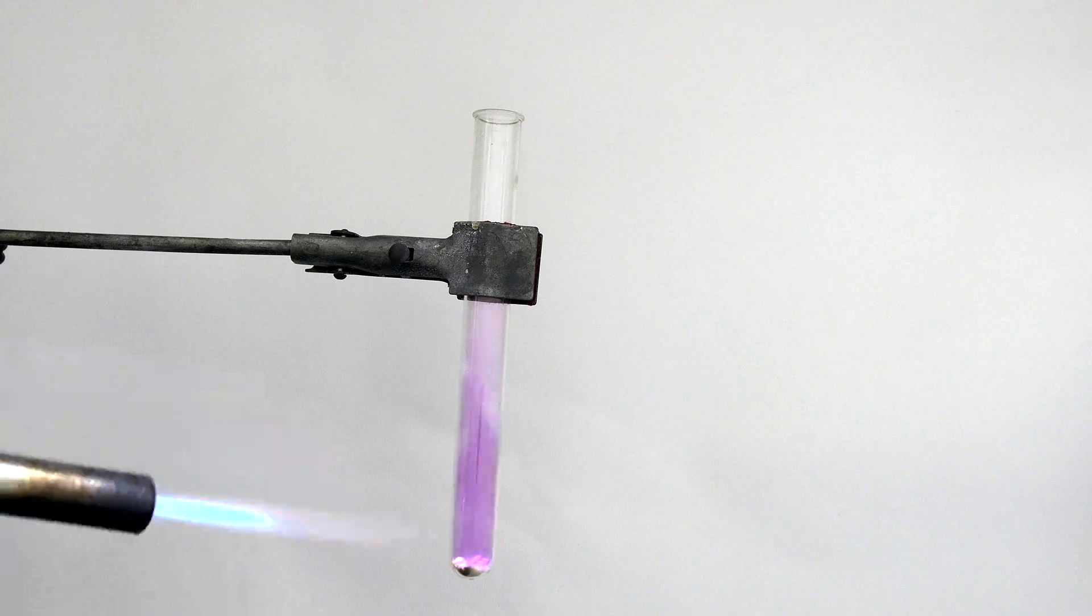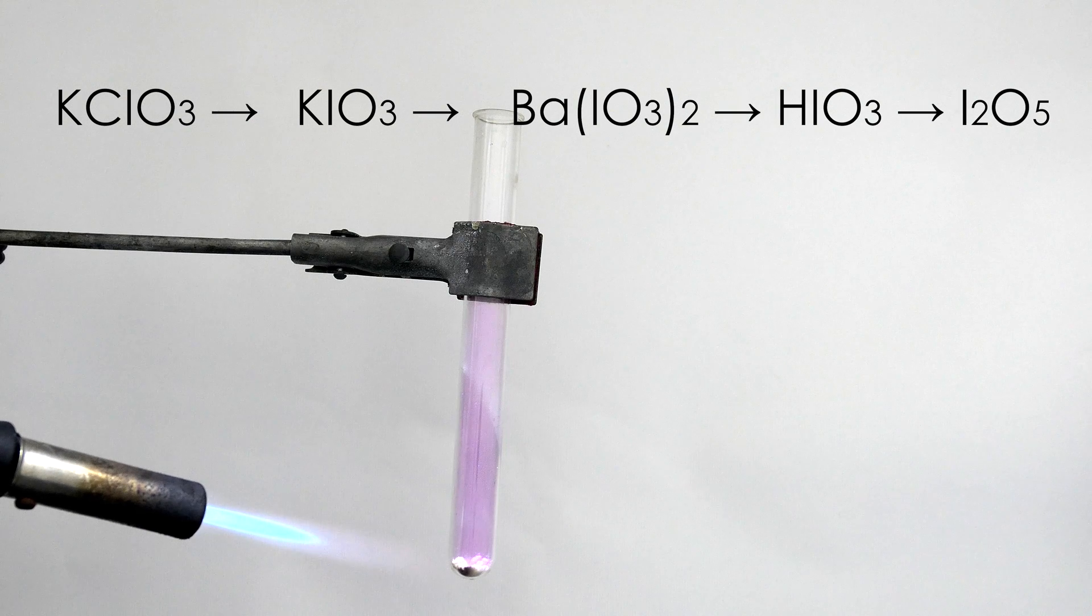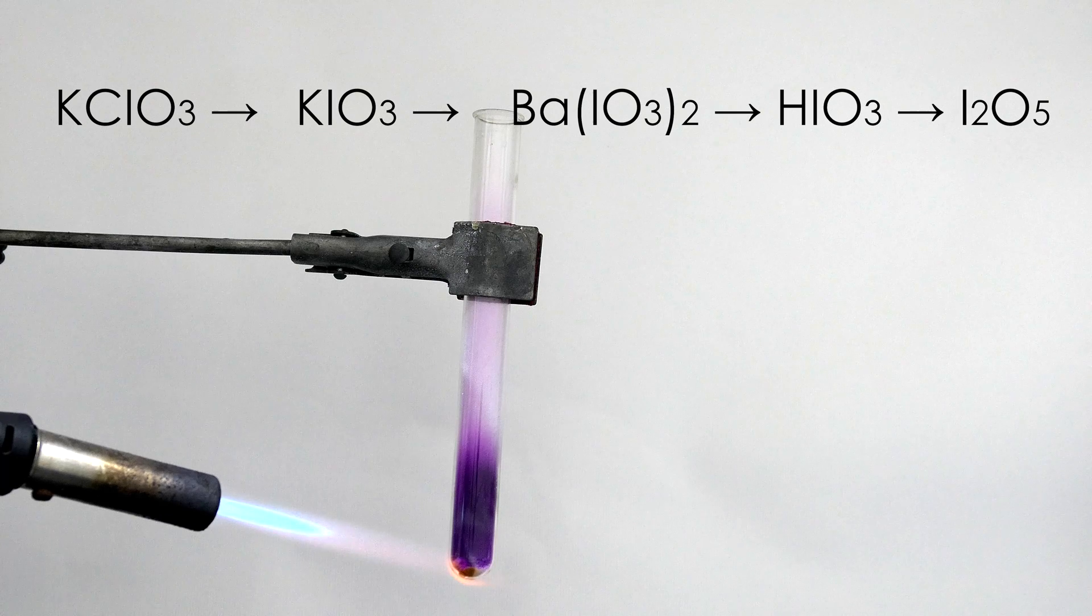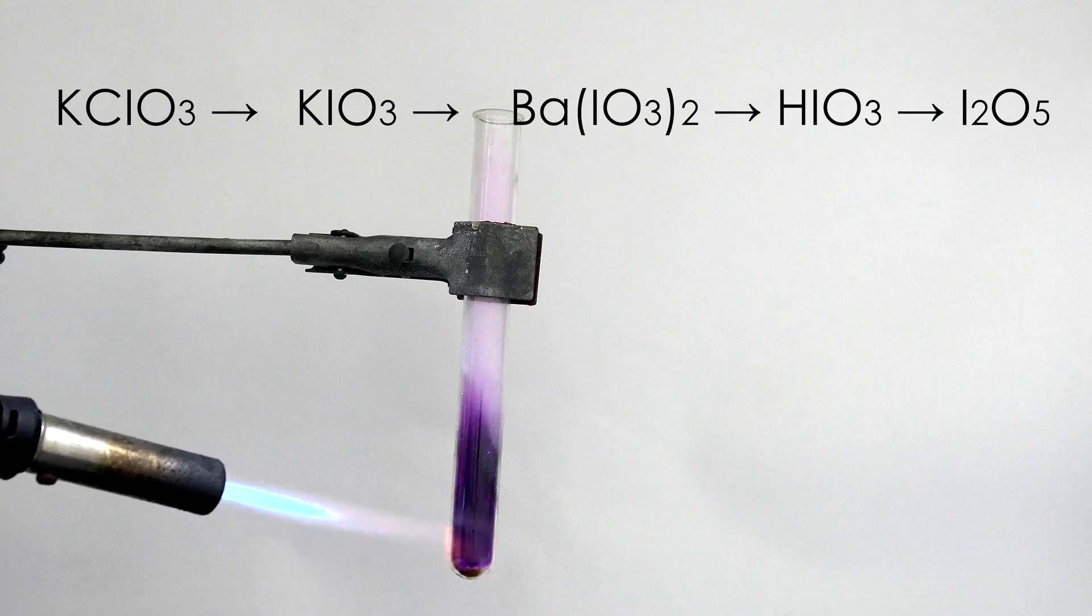To prepare this compound, I first convert potassium chlorate to iodate, then to barium iodate, then it's reacted with sulfuric acid to get iodic acid. Finally, it's dehydrated to iodine pentoxide.